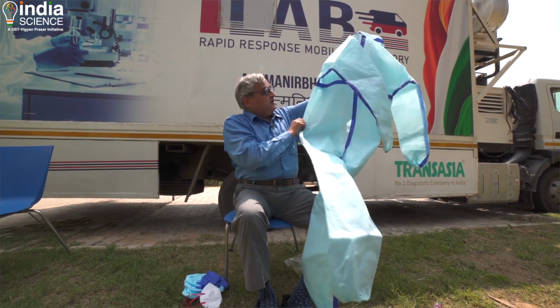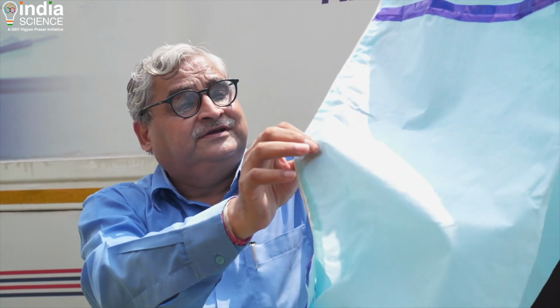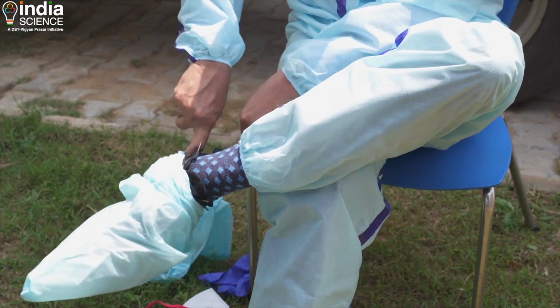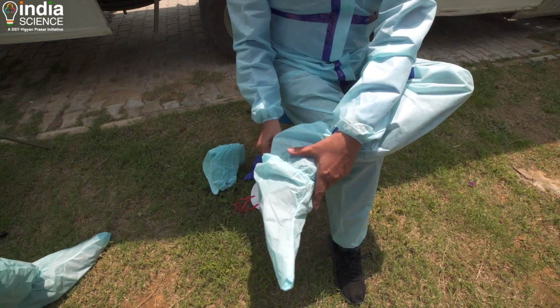Okay, one has heard so much about PPE kits. Now we will don a PPE kit and go into an area. This is what a PPE kit looks like. There will be a pool of sweat once one comes out of it. You can imagine it is a struggle if you have to do this every day and you have to work in this.